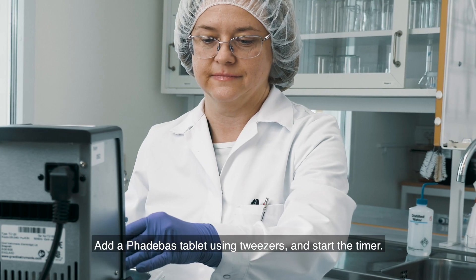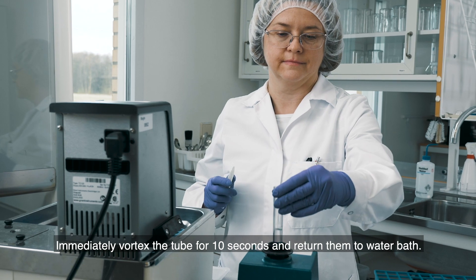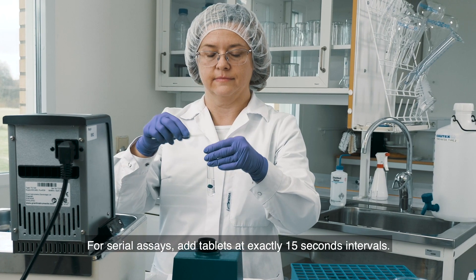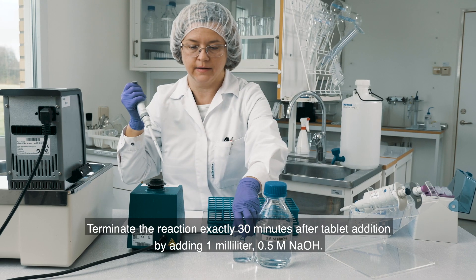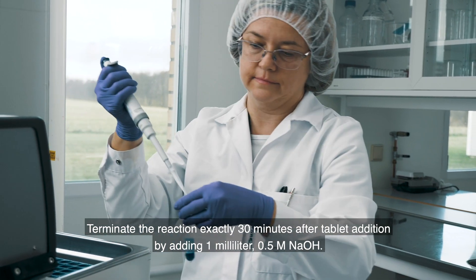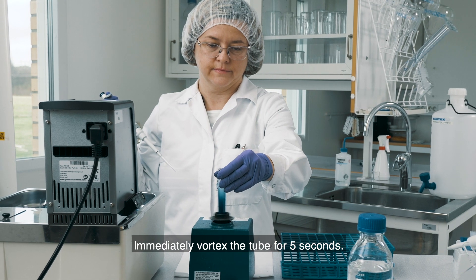Add a Phadebas tablet using tweezers and start the timer. Immediately vortex the tube for 10 seconds and return them to the water bath. For serial assays, add tablets at exactly 15 second intervals. Terminate the reaction exactly 30 minutes after tablet addition by adding 1 milliliter of 0.5 molar sodium hydroxide. Immediately vortex the tube for 5 seconds.